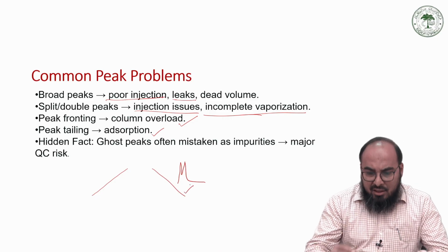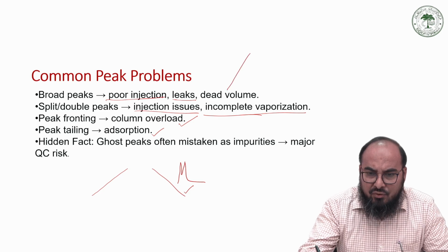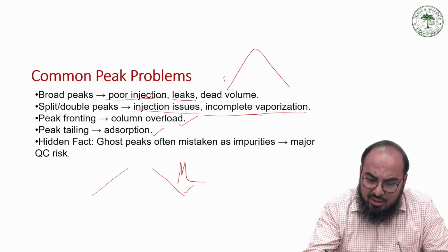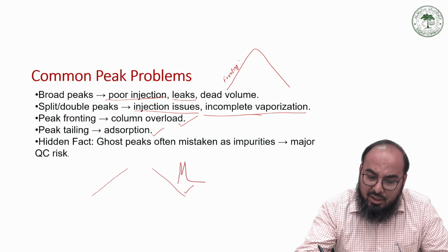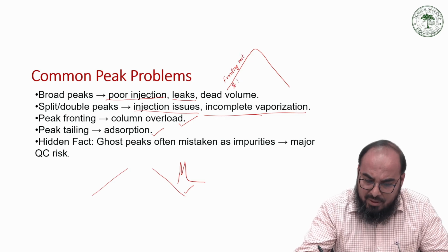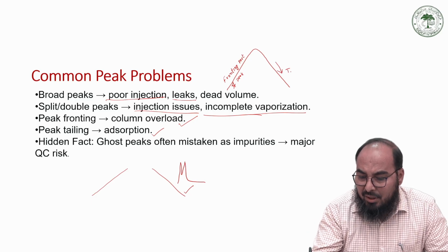Now, if you want to draw, this is the fronting part of the peak, and this is the tailing part.